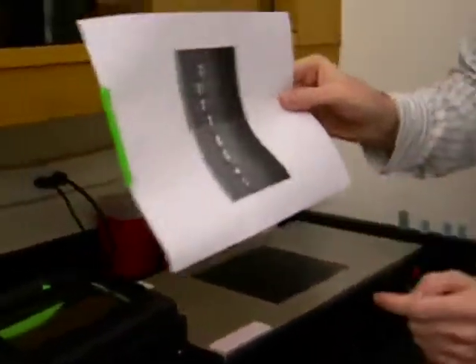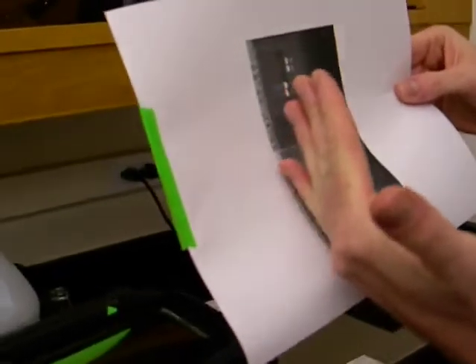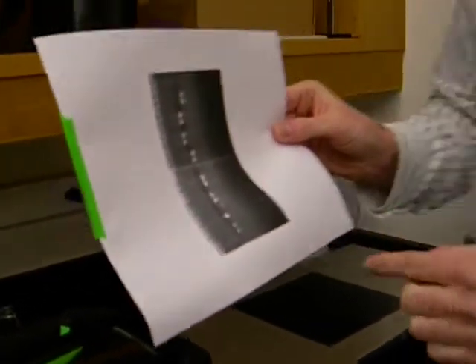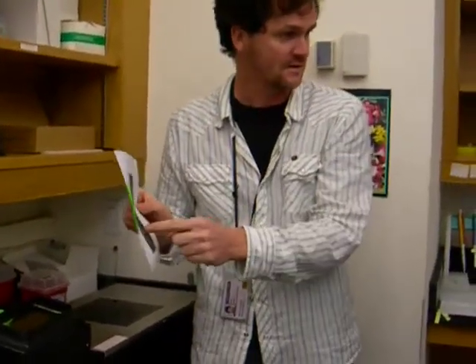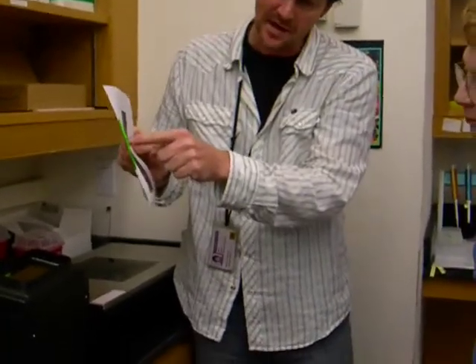You can see the little holes where they initially put the DNA in, and then the current pushed the DNA this way. A lot of other DNA is still in there, but we can't see it because there's not enough of it to visualize on this gel. But this is the target area that we tried to amplify — the area where we set those primers on either end and made millions of copies. That band probably represents tens of thousands, if not tens of millions, of copies of that one particular piece of DNA.